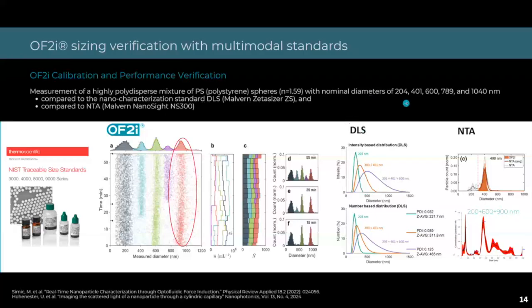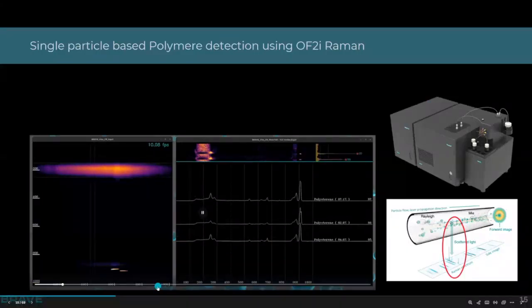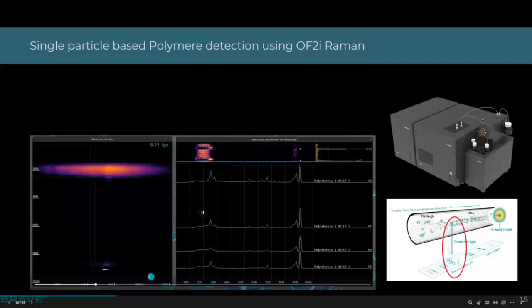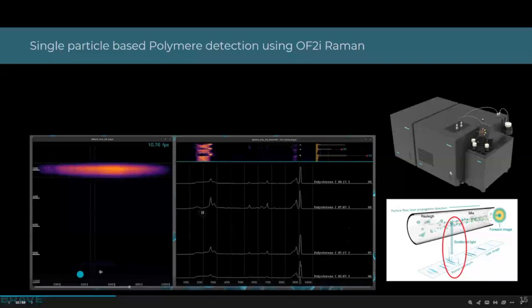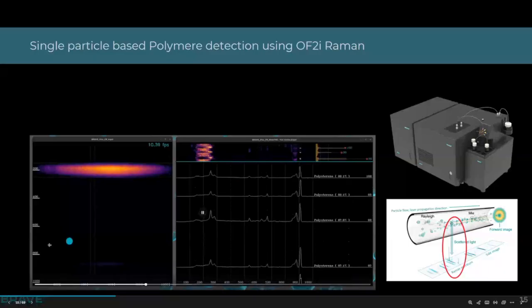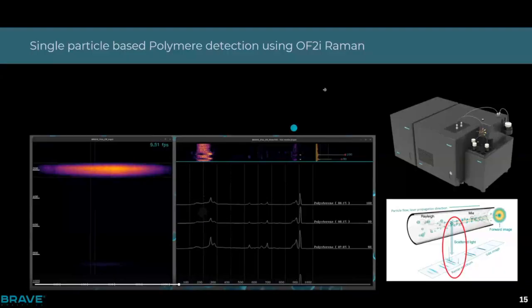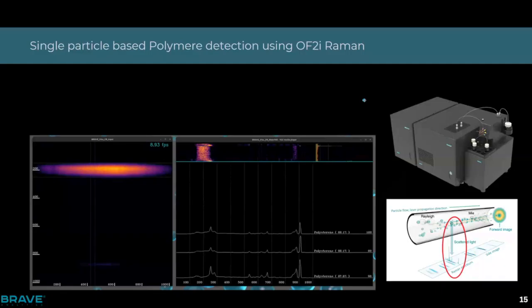And this is the really nice thing, that we can do this automatically as a flow-through principle. Here, particles flow through. We already have the software from our previous characterization work so that we can track them. And now they just flow through, and we collect the spectra. With this information, we thought, hey, it is very helpful to measure contaminations.